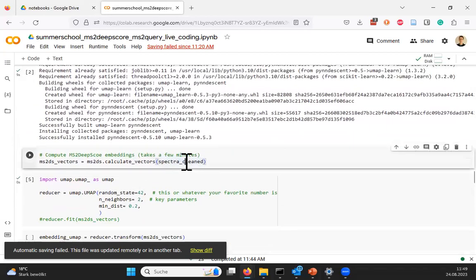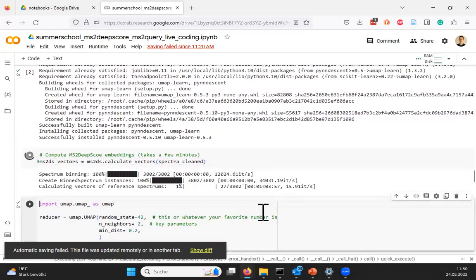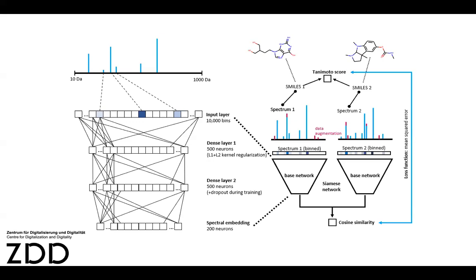And then the costly step is this one. This will cost you a bit of time, because what we do here is convert all spectra into bit spectra. This is very quick to see, but then it's feeding every spectrum into this deep learning network. What we get out of this, I can show you a slide again, maybe. I will just go back to slide 4. So what we actually do is feed it all the spectra in our data set now, every one of them, and then we get some numbers out. And these are the numbers at this point, which we will now store.